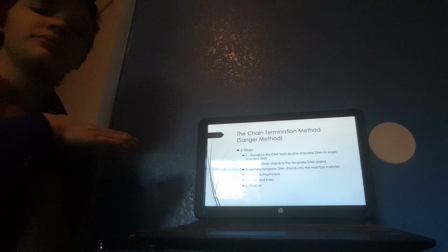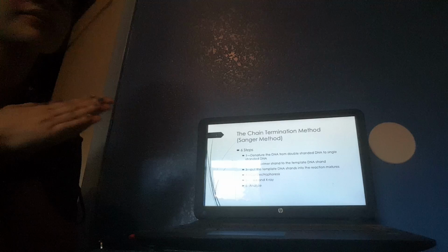There are many different methods of determining this. Today I'm going to be talking about the chain termination method, also known as the Sanger method. There's essentially 6 steps to it.